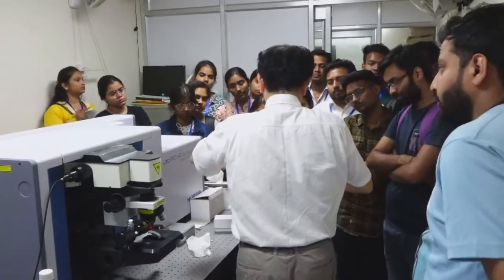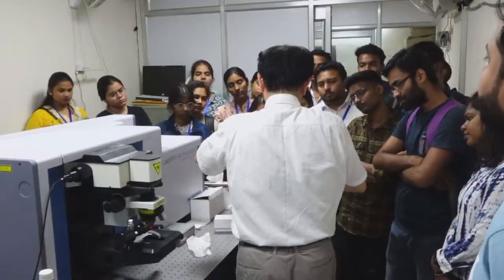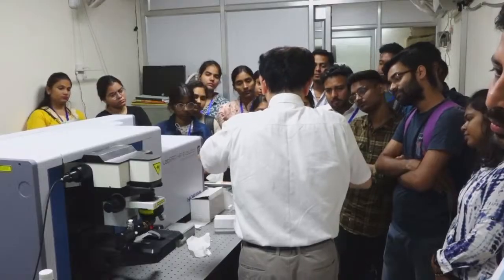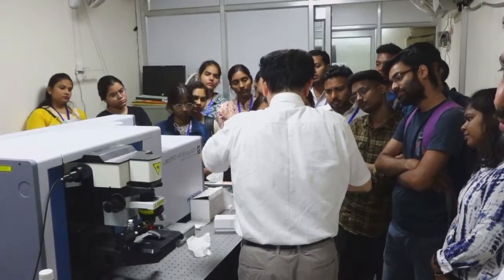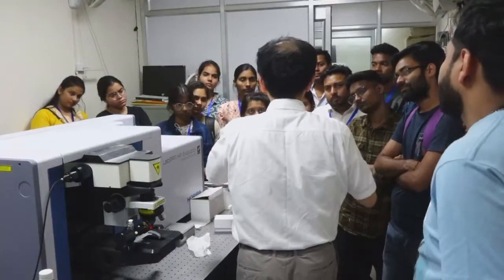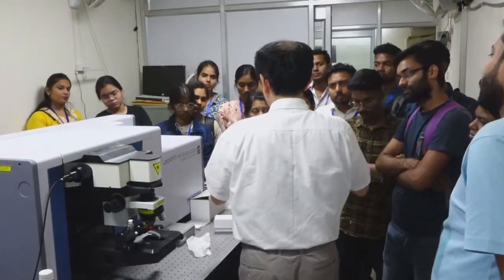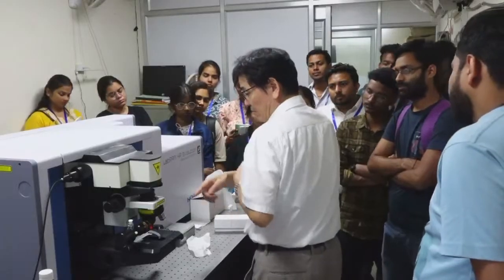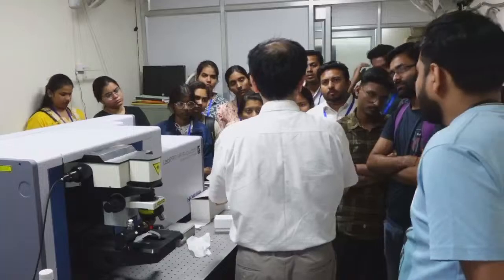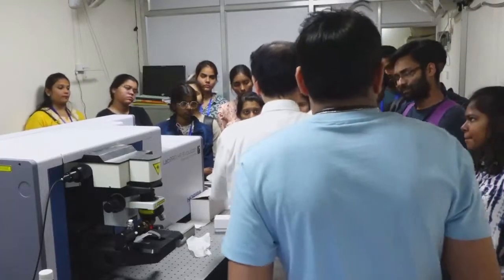If we focus the laser onto a smaller spot, the density increases. Further decrease, and the photon density becomes much larger. Accordingly, the Raman signal becomes much larger. So in that sense, tight focus is advantageous to get a larger Raman signal.